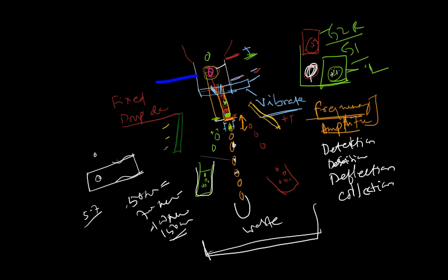I will talk in greater detail about how a sorting setup is done. However, the few things that you will need to keep in mind are the size of the cell and the size of the nozzle that is used, and how we prepare the cells. A nice single cell suspension is needed. The better the cell suspension prepared, the better the sorting is. If a large clump comes through, it could clog the nozzle, and then you would have to completely restart the sorting process.